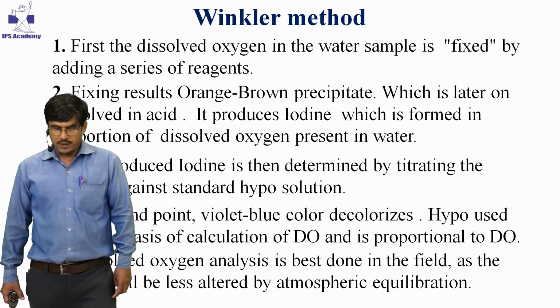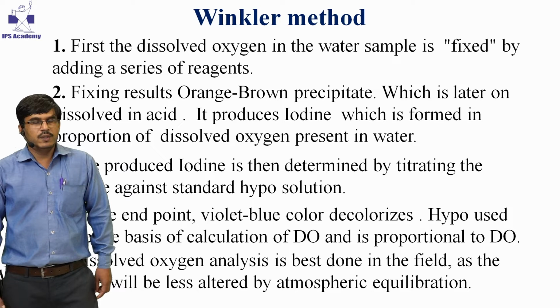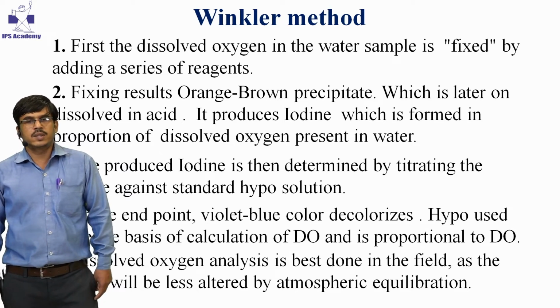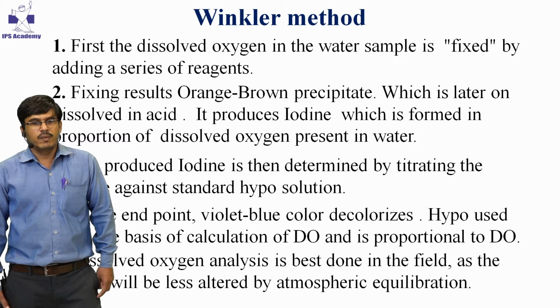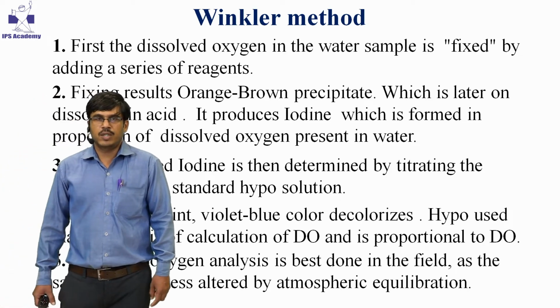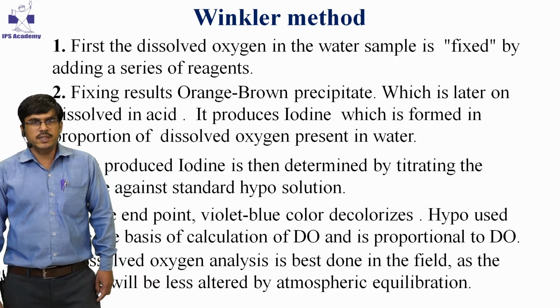In this method, we have to fix the dissolved oxygen present in water at the sampling site, as with time and with movement in water, the quantity of dissolved oxygen varies.